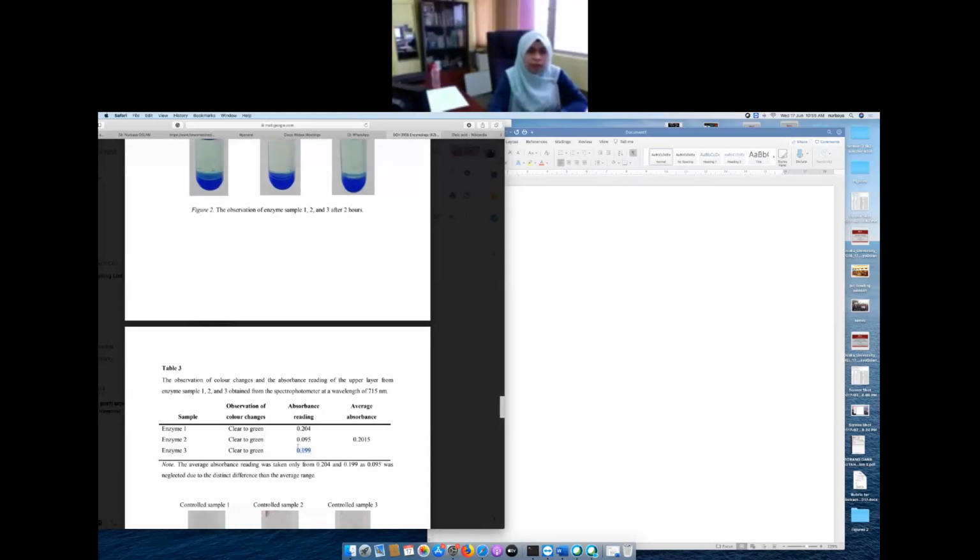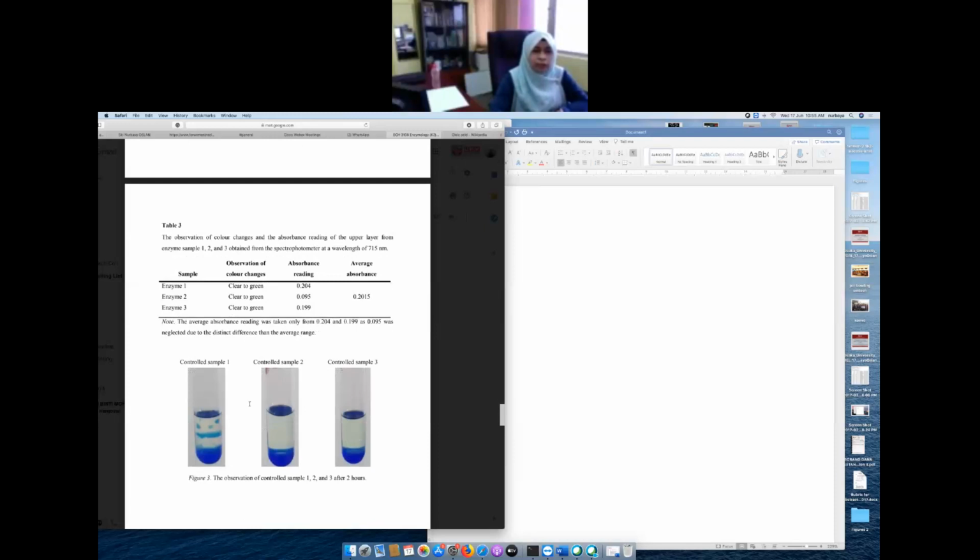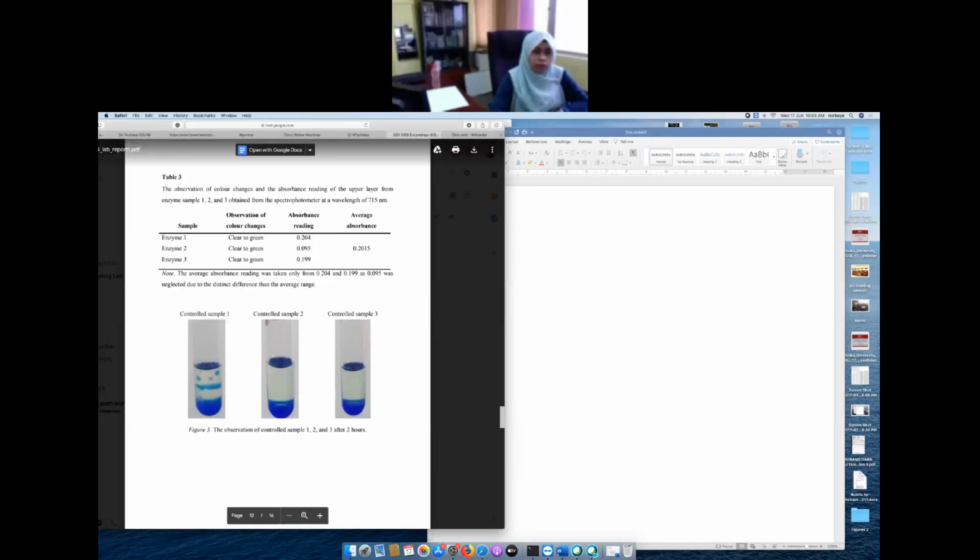Since this group decided to take only 0.2 and this one, and then take the average, the average absorbance is 0.2015.